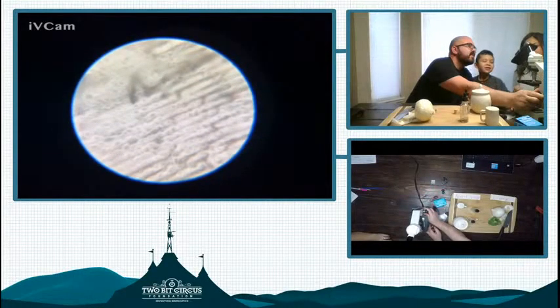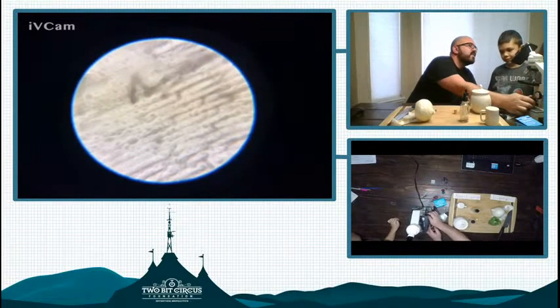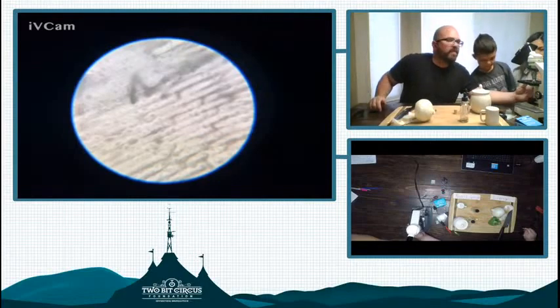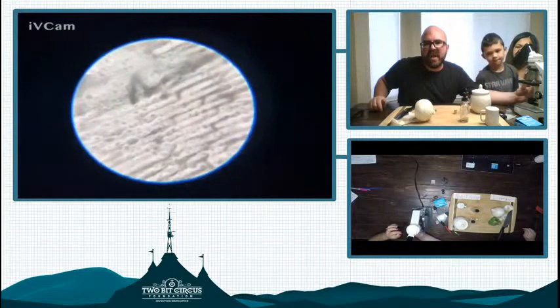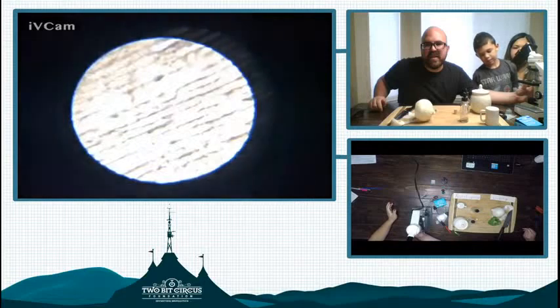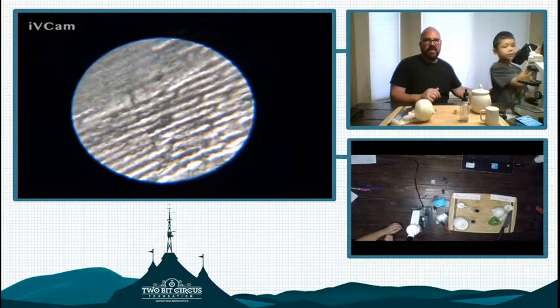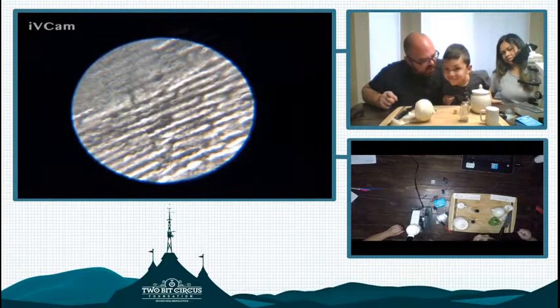From the other one, when it was lit. That's water. Yeah, that's the water that got splashed on by the release of the onion. Awesome. So you could see there, you know what helps too? The diaphragm, changing the amount of light that comes in through the diaphragm. So you can kind of see the structures there better. Robert, look at that. You see the structures? So you could see the little cells in the onion.